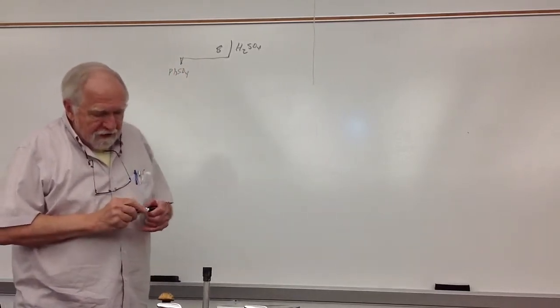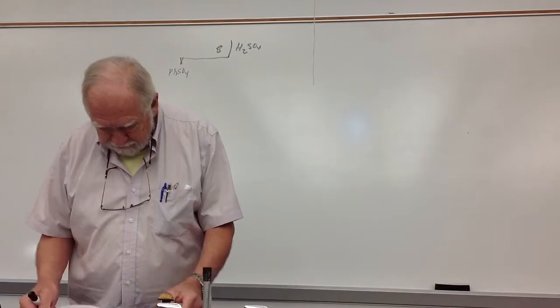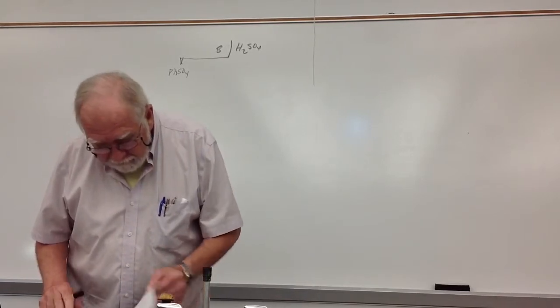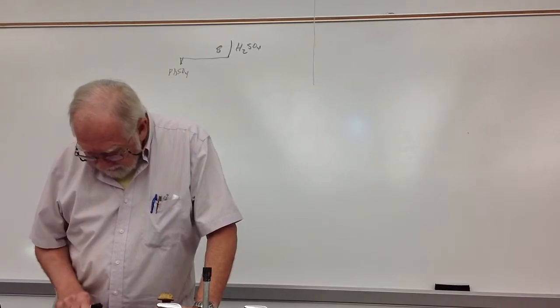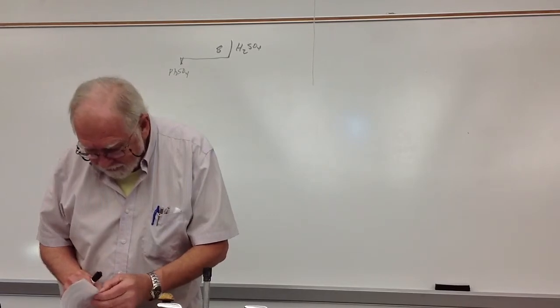So what we're going to do is look at procedure 8 here, because this is what people miss. It says add the sulfuric acid, dense white fumes, turn the page, and this is a turn 2 pages or something, and you get to the wrong procedure.